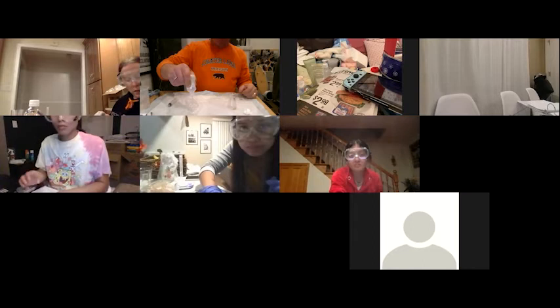Take a small cup like this, and we're going to fill about halfway with our sodium hydroxide. Here's our 1 molar sodium hydroxide. It says careful, and you should be. Audrey got her gloves on, but no goggles. What the hell? I can rinse base off my hands a lot easier than I can wash it out of my eyes. You know what I'm saying? This is kind of tough. You have to give this a really hard squeeze, and it's going to take a while.